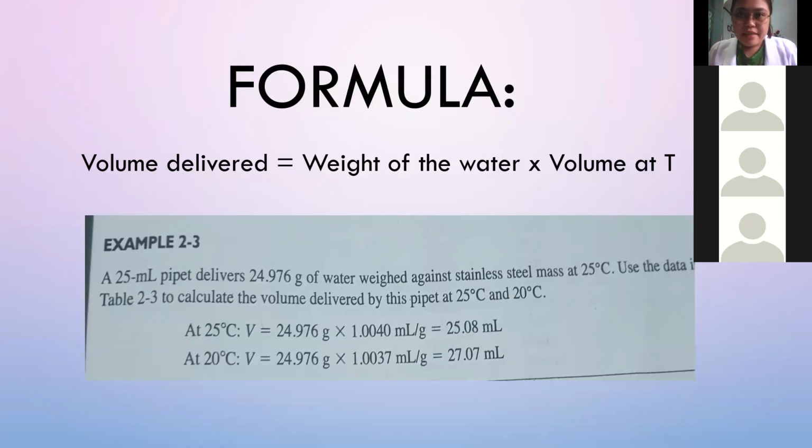Ma'am, ginahimo ang calibration before starting the experiment, before really using the apparatus for the experiment? Yes. So i-calibrate siya nato, kanang water ato ang ginagamit for calibration, di ba? Mag-measure ta og certain volume sa water, i-weigh nato ang water, and then i-correct nato ang volume until makuha nato ang difference na 0.02 ml.